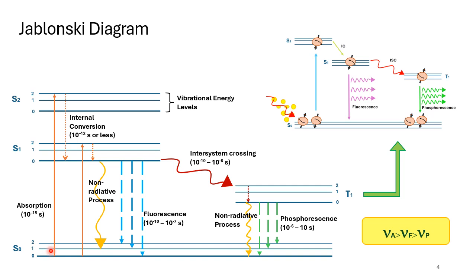You can see here that the energy difference between S2 and S0 is greater than S1 and S0, which is further greater than the T1 and S0 energy difference.